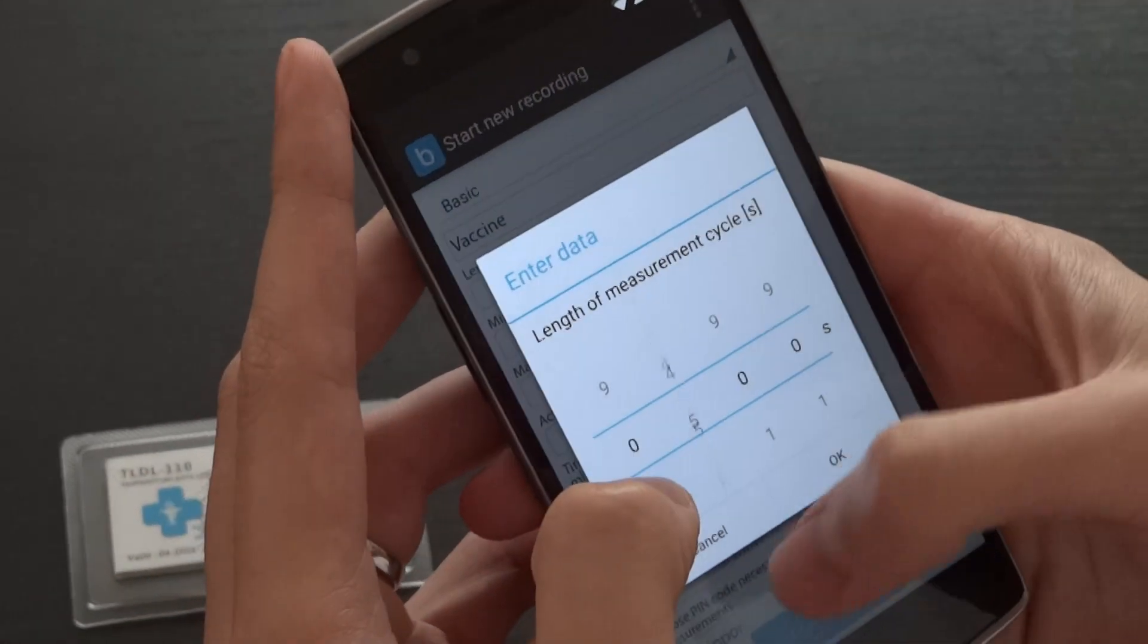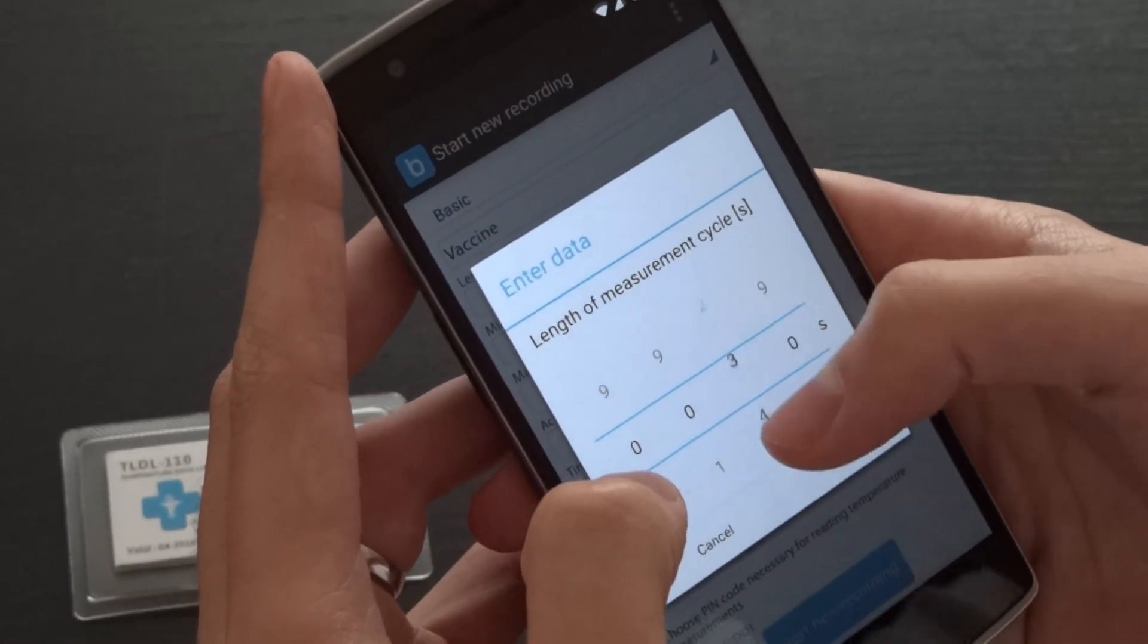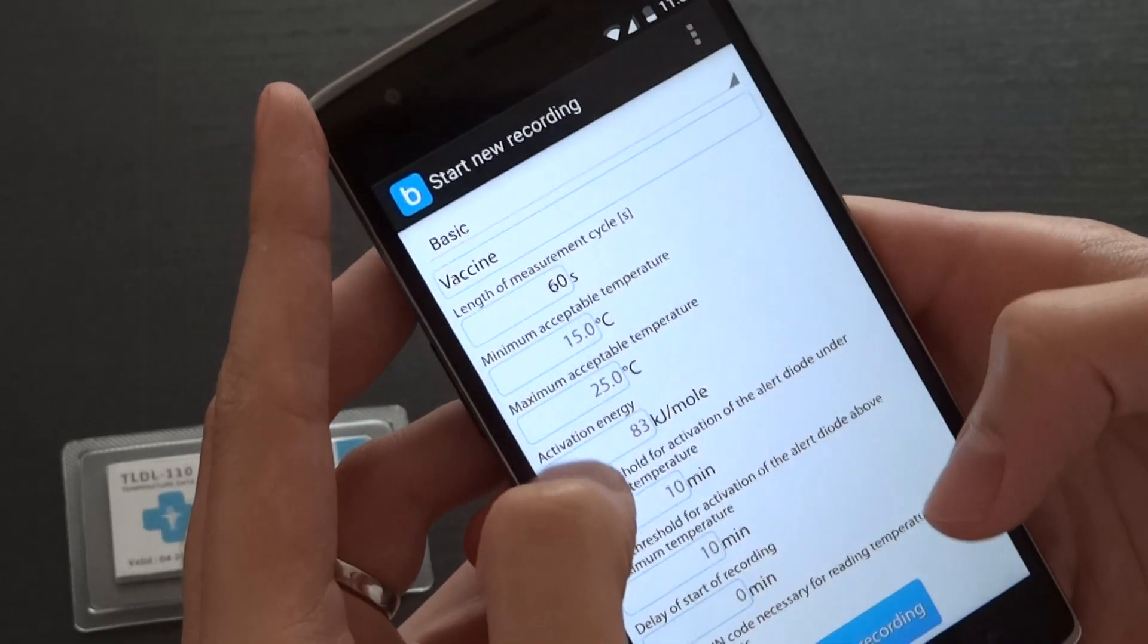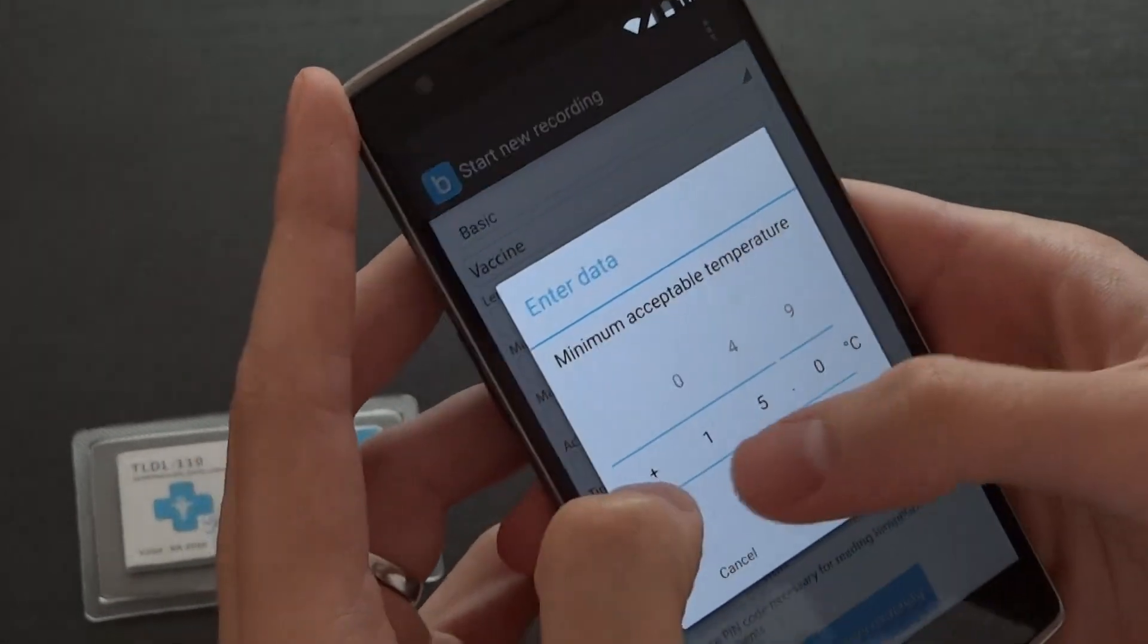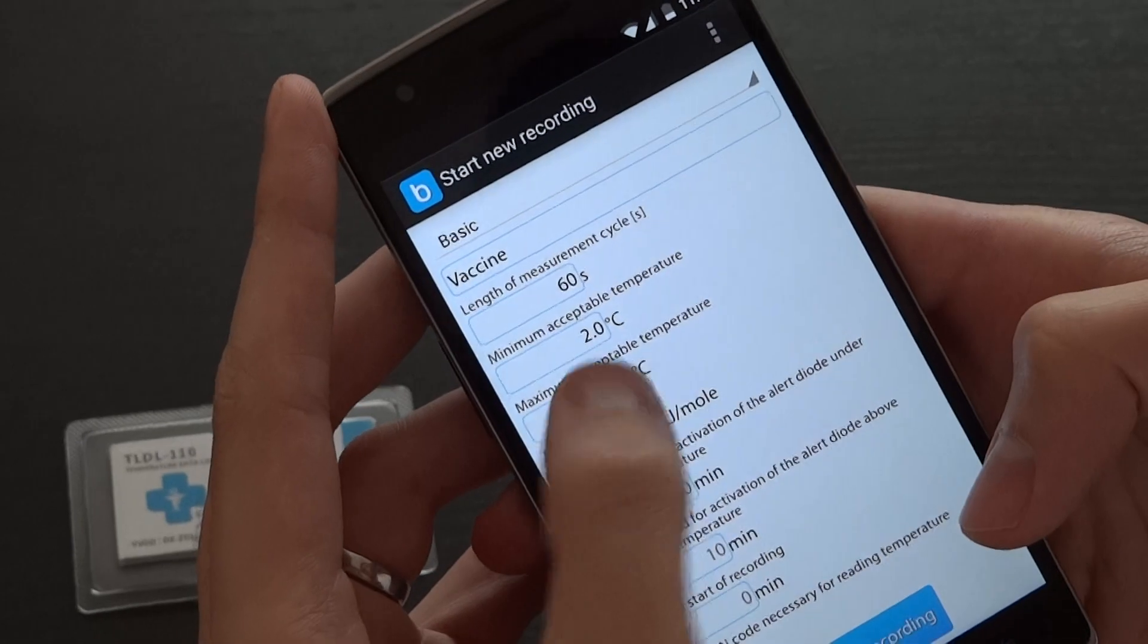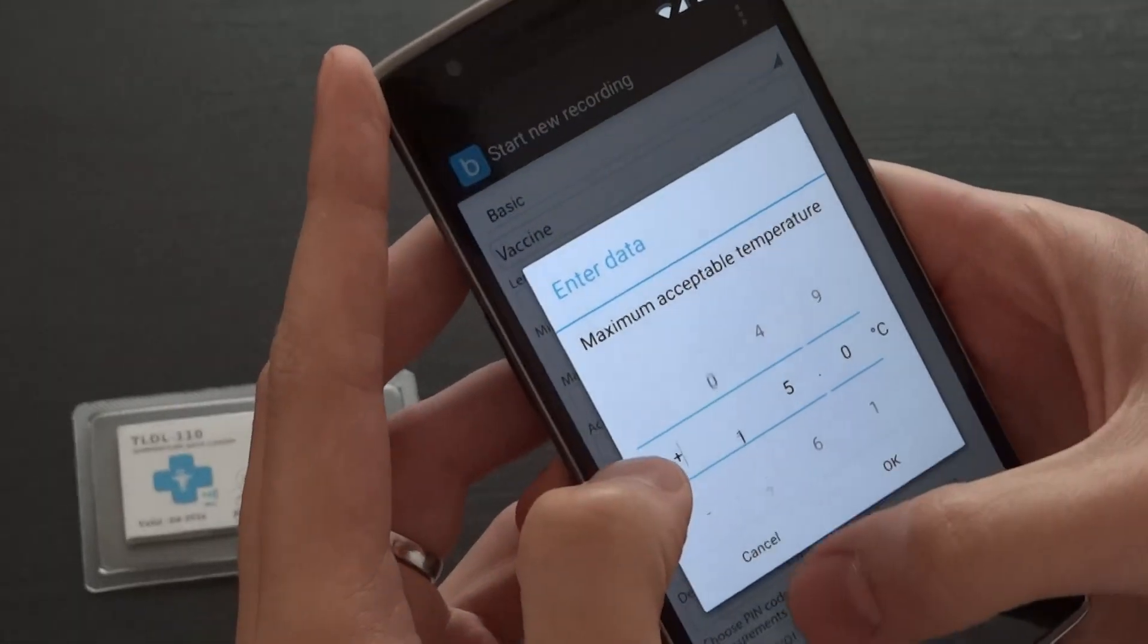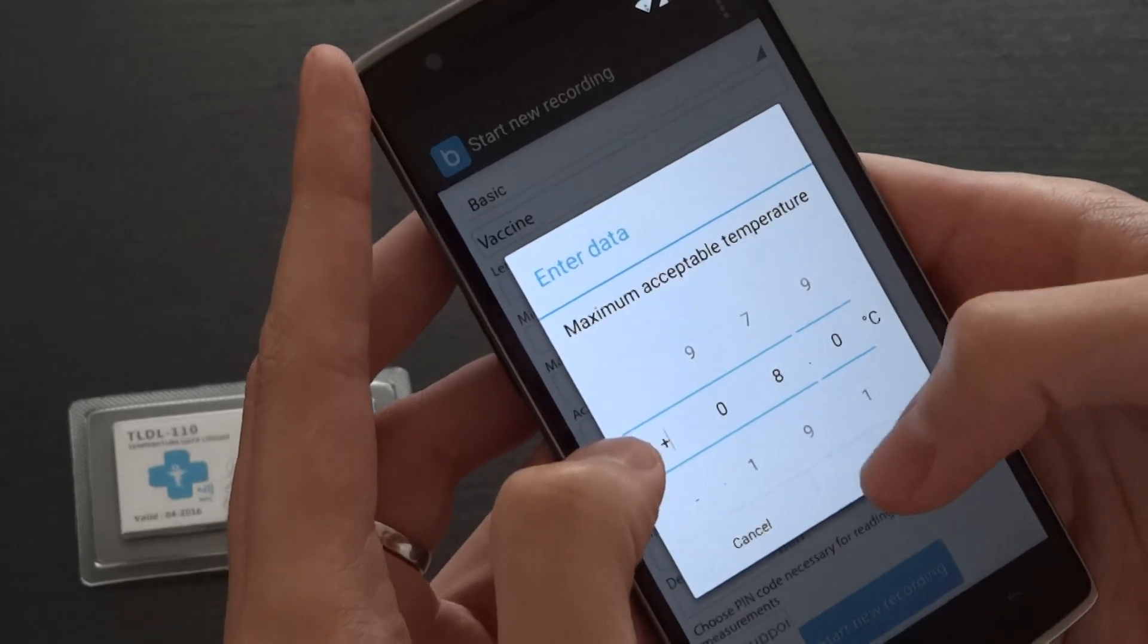Choose length of measurement, for instance every minute. Set minimum acceptable temperature, in this case 2 degrees, and maximum acceptable temperature, in this case 8 degrees.